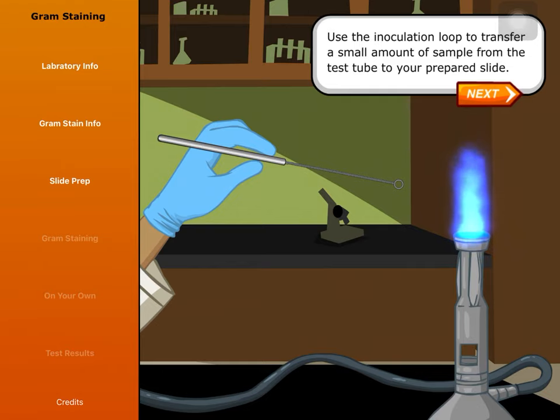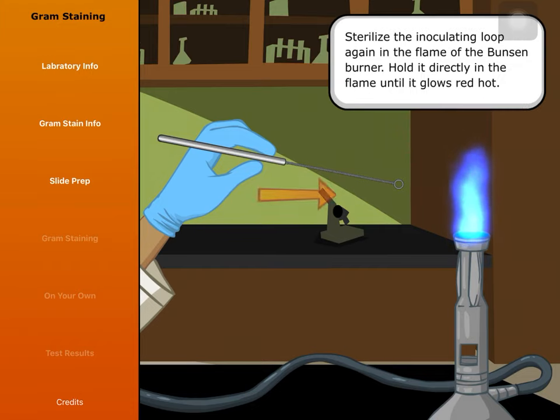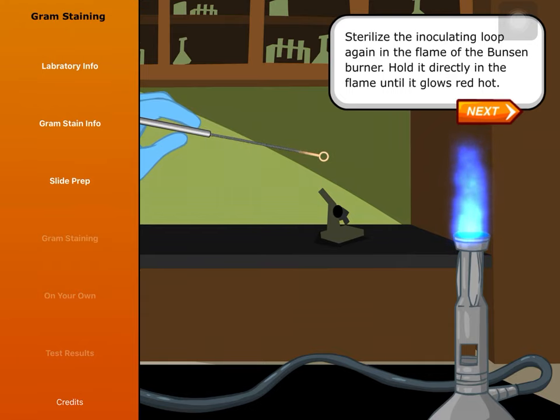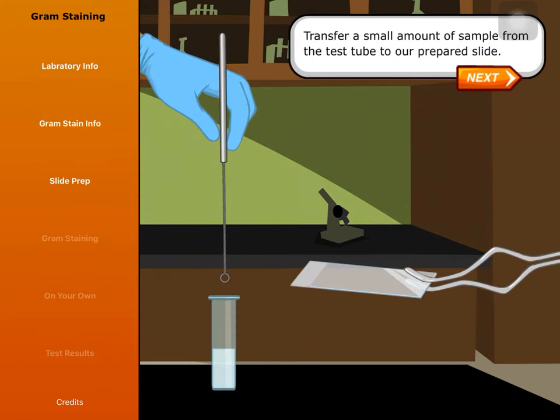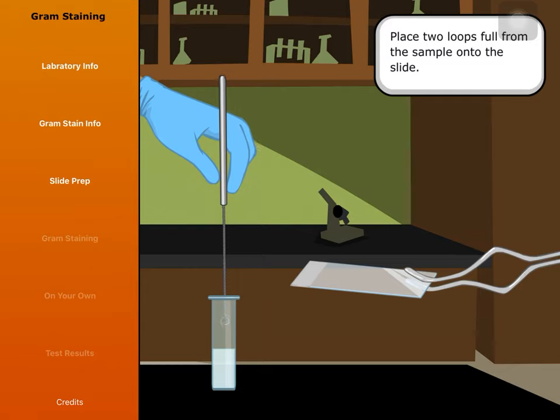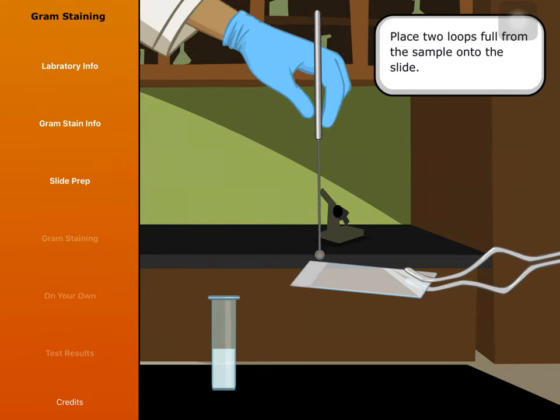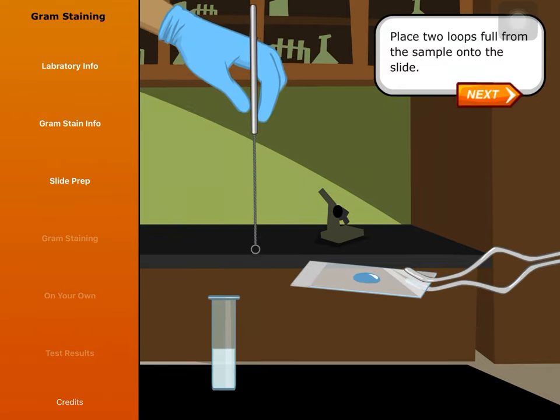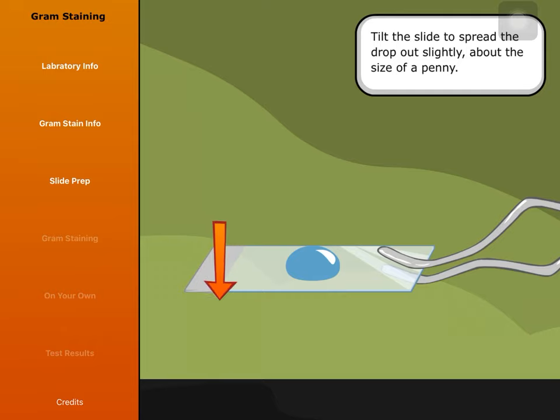Use the inoculation loop to transfer a small amount of sample from the test tube to your prepared slide. Sterilize the inoculation loop again in the flame of the Bunsen burner. Hold it directly in the flame until it glows red hot. Transfer a small amount of sample from the test tube to the prepared slide. Place two loops full from the sample onto the slide. Tilt the slide to spread the drop out slightly, about the size of a penny.